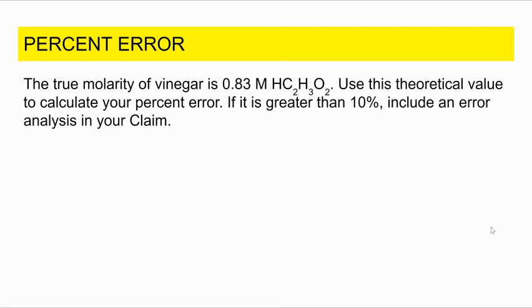Okay, now that you've collected your data, please note that the true molarity of vinegar is 0.83 molarity. So use this theoretical value to calculate your percent error. And if your percent error is greater than 10%, please include an error analysis in your claim.